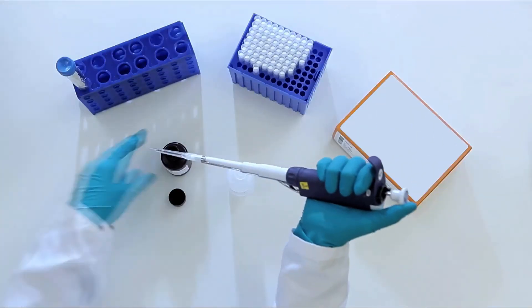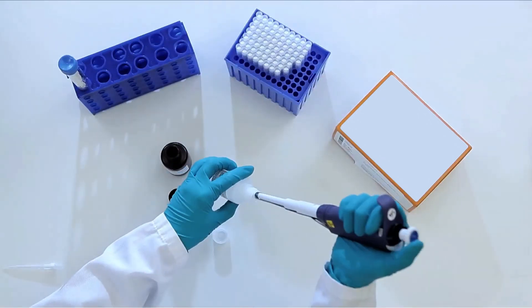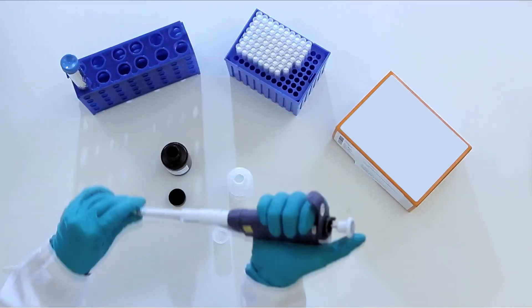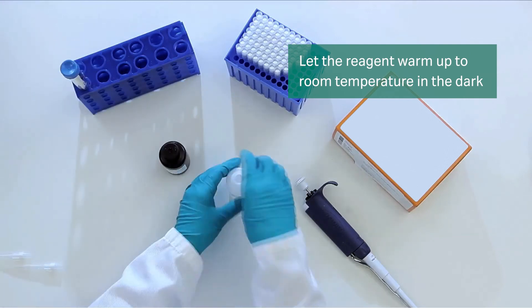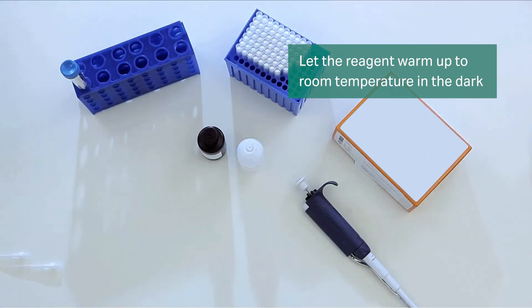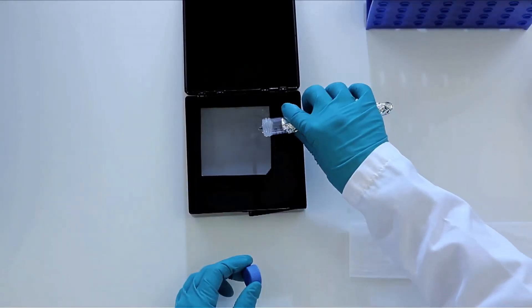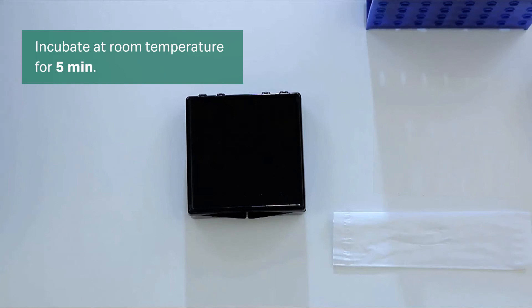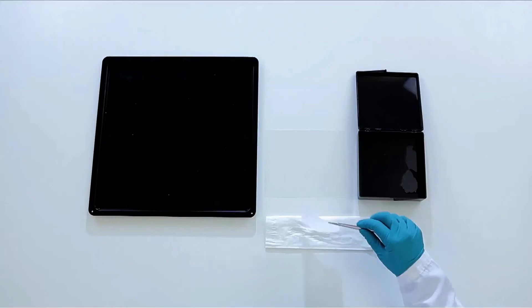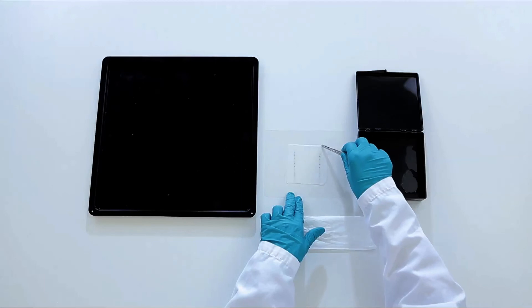ECL Prime reagent is the ideal choice for detection in Western blotting. It works well with all detection methods. Prepare ECL Prime according to the instructions and allow it to warm up to room temperature in the dark. Add the reagent to the membrane, making certain the entire membrane is covered. Incubate the membrane for 5 minutes at room temperature, in the dark if you choose. Drain excess reagent and place the membrane on a clean, smooth surface such as plastic film.